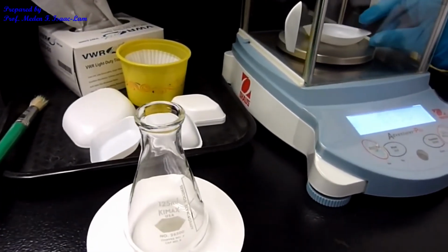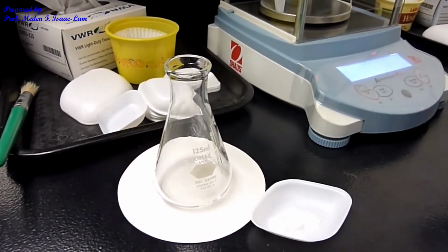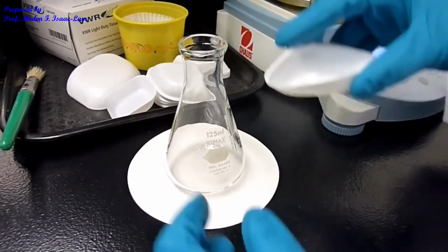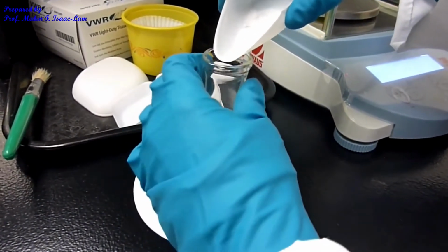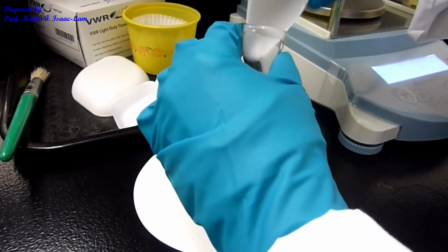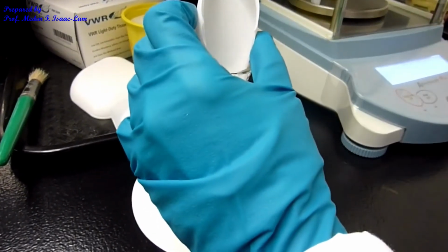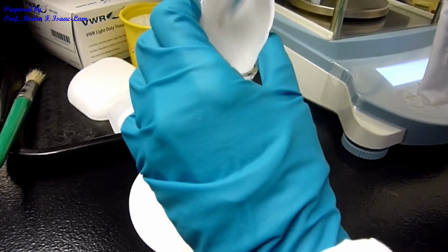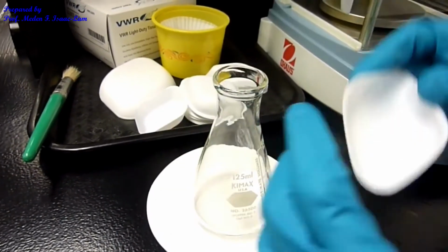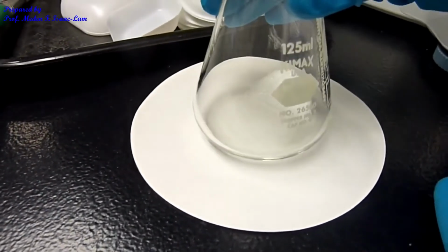So I will take out the sample that I weighed. And then I'm going to transfer it into the e-flask. Transferred everything. And I always have a support at the bottom just in case I spill it, just like a filter paper.